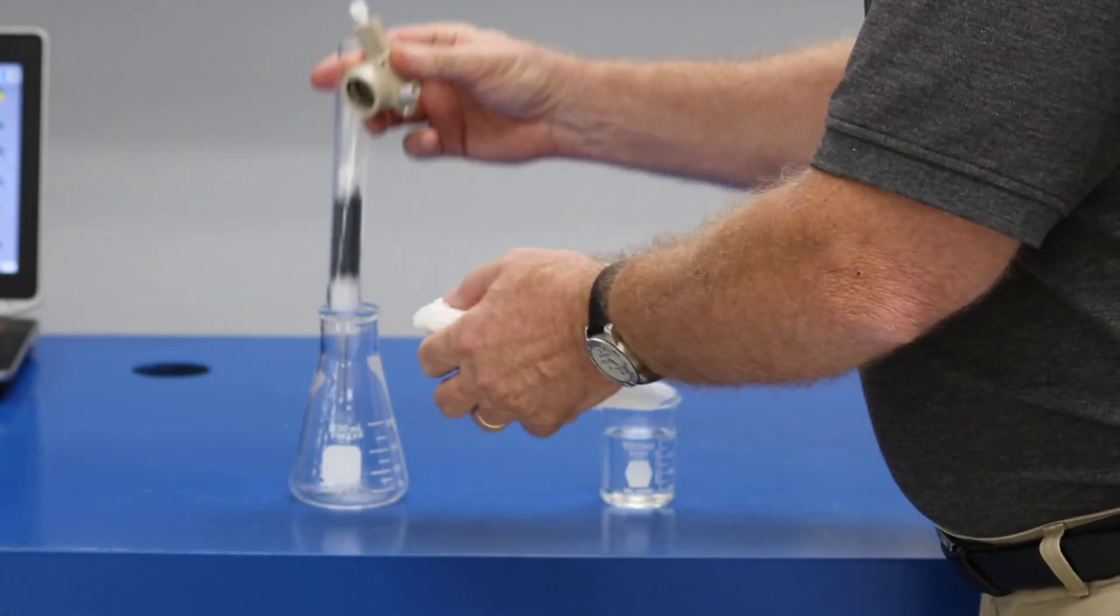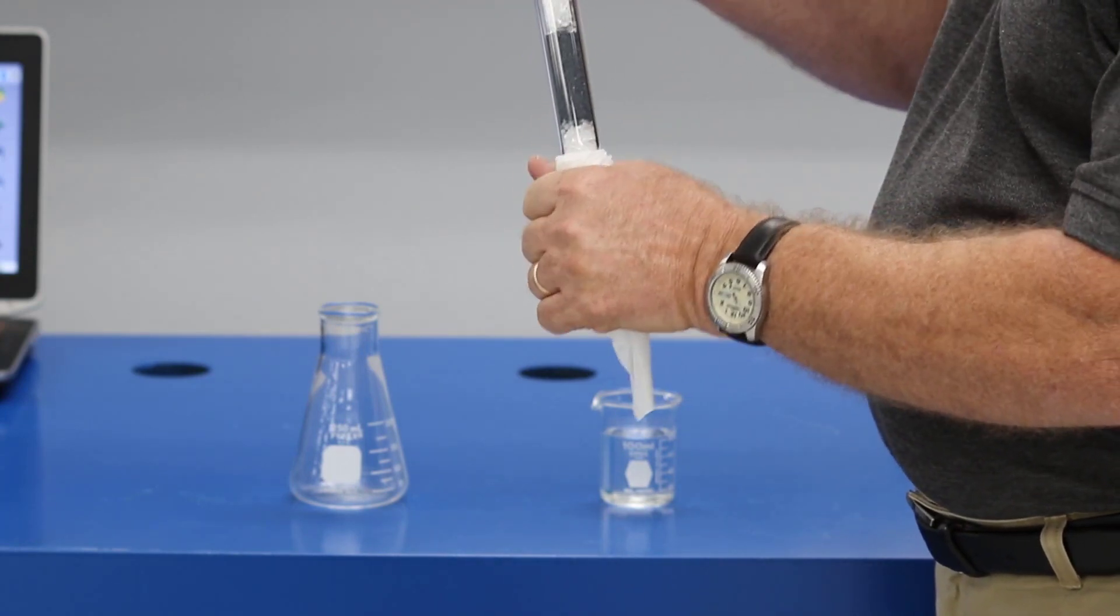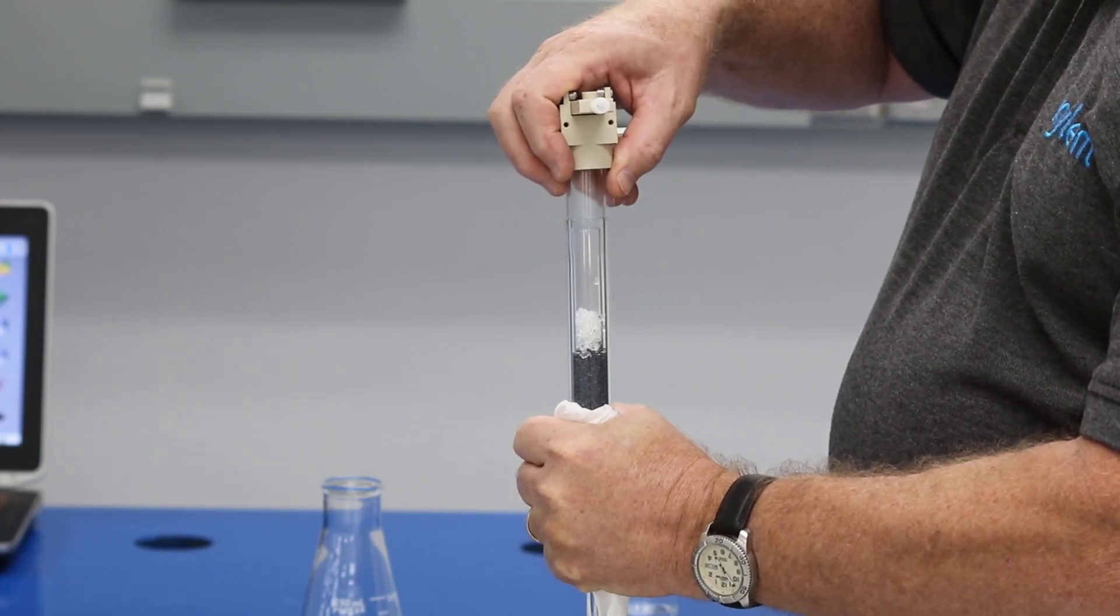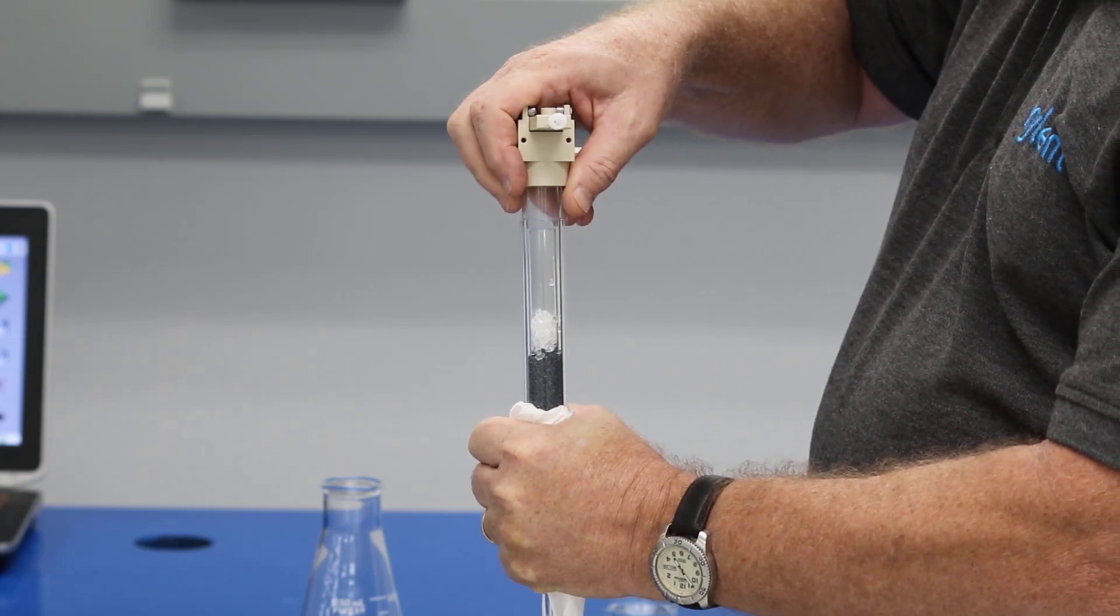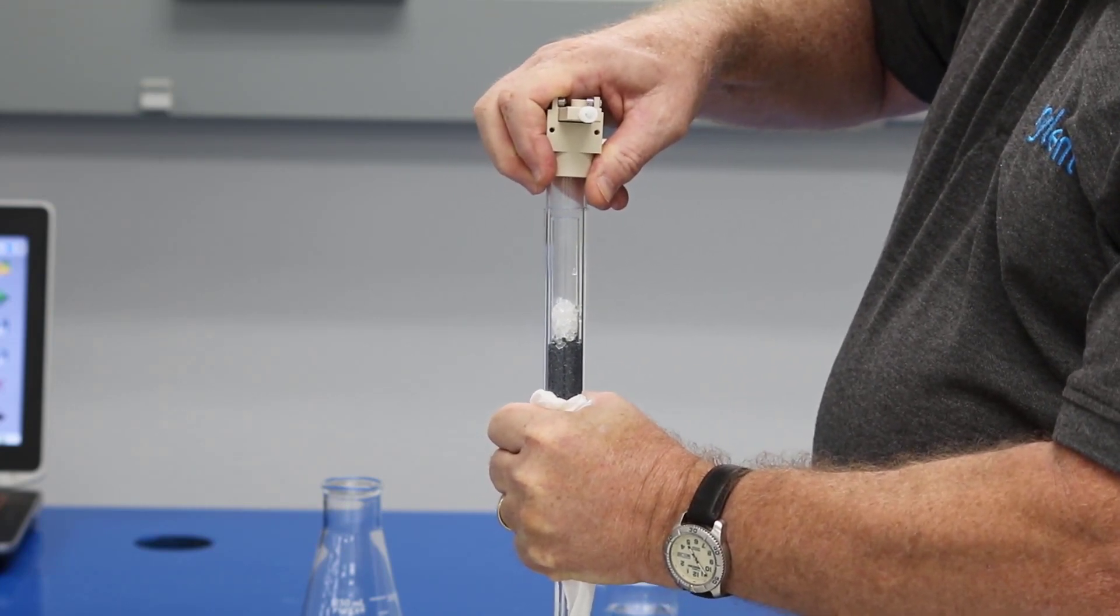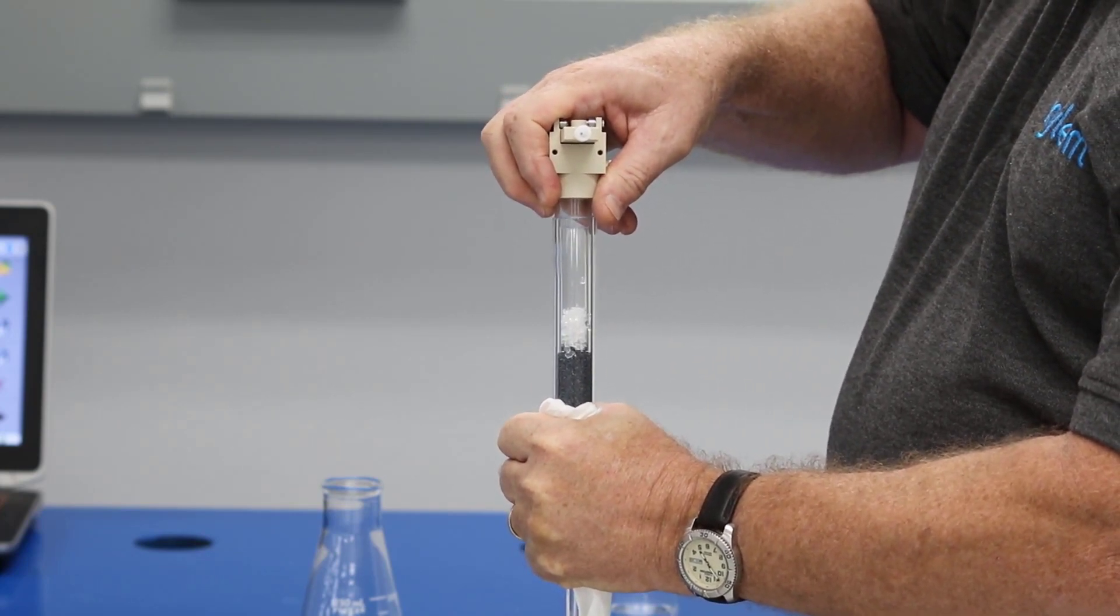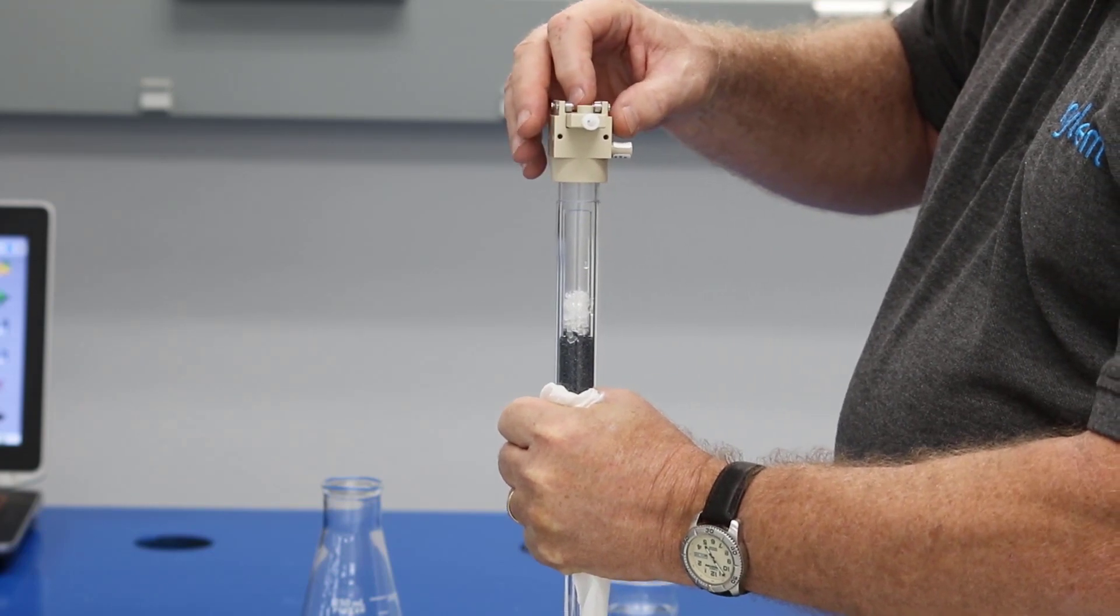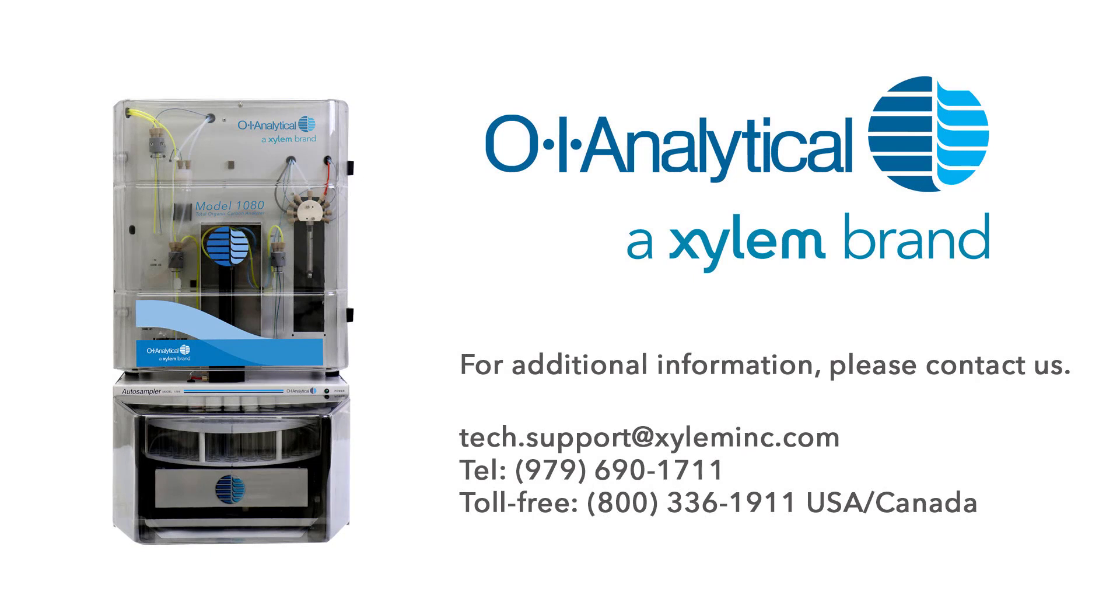So I'll grab my combustion tube, hold it by the stem, place the cap on top, push down slightly. You'll feel it go past the first O-ring, then push down just a little bit more, and you'll hear it click into place as it went past the second O-ring and came in contact with the top of the cap and slider assembly. Thank you very much.